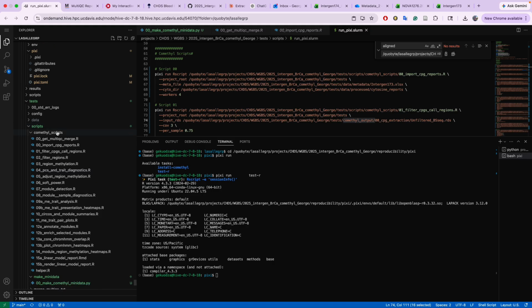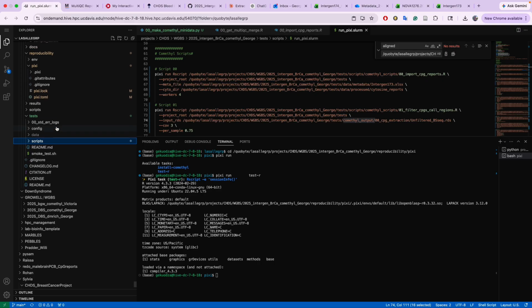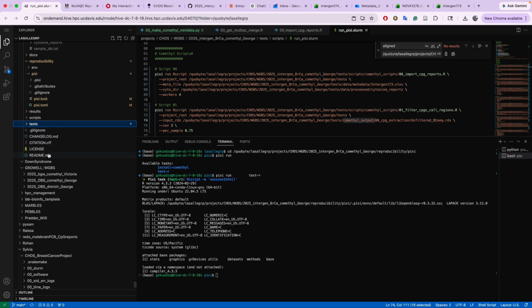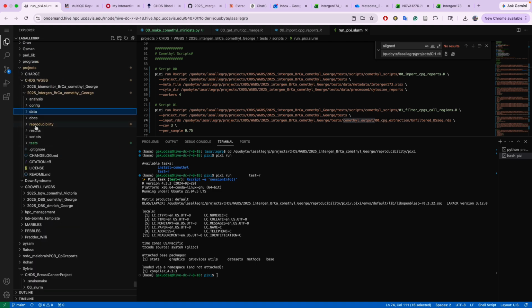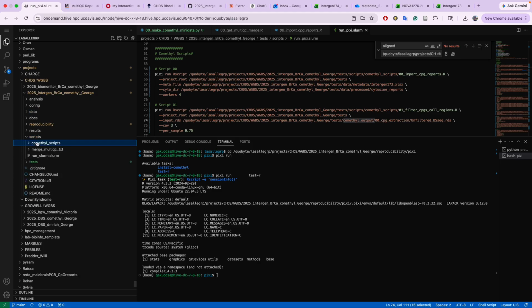At least I guess what we can also try to do to save time is get the other scripts for the original run ready to run. Okay. So let's see. So this is the docs, the data folder. Okay.